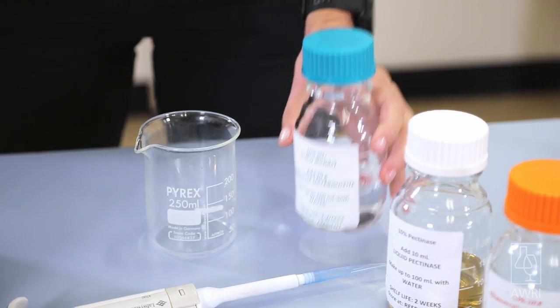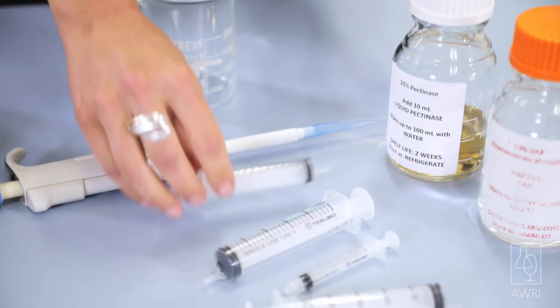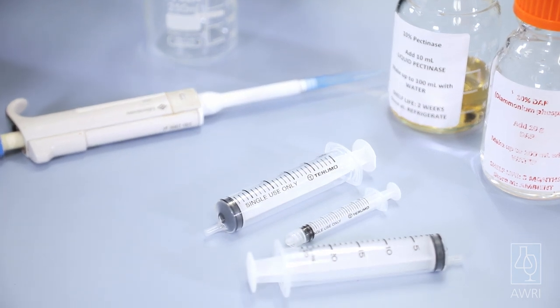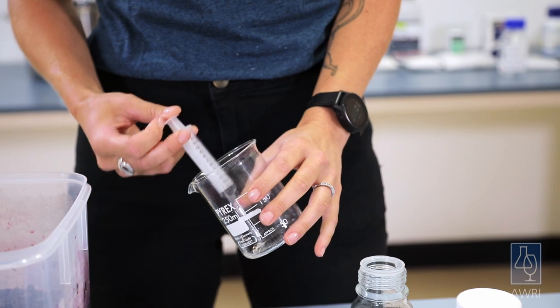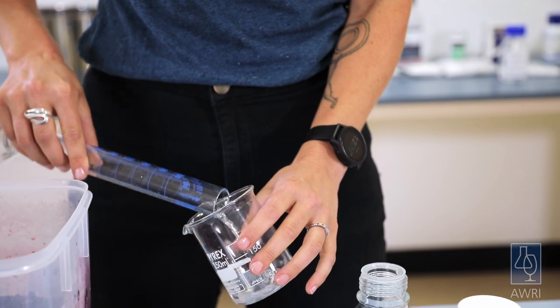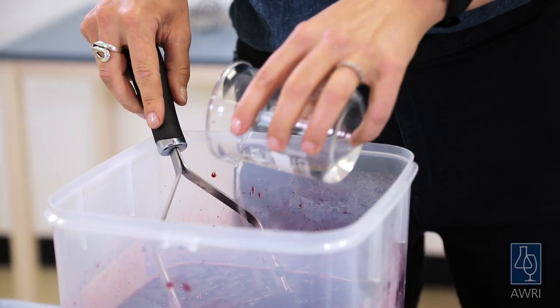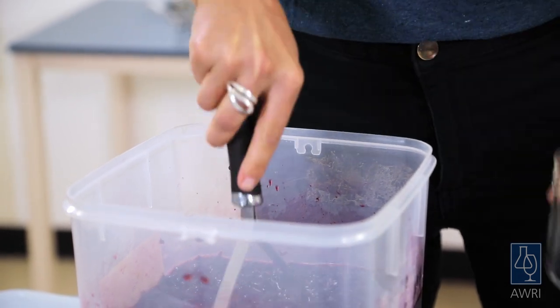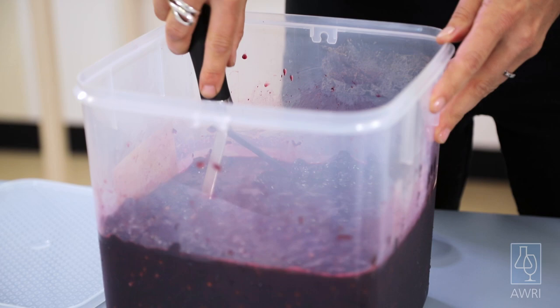Add the sulphur dioxide, pectinase, and DAP solutions using a pipette or a plastic syringe — like those available from a chemist — to measure the required volumes. Don't mix the sulphur dioxide and enzyme solutions together; add separately, then plunge or mix well between the different additions. You can also dilute the solutions further with water to around 25 millilitres prior to addition, which will ensure an even better dispersal throughout the must.